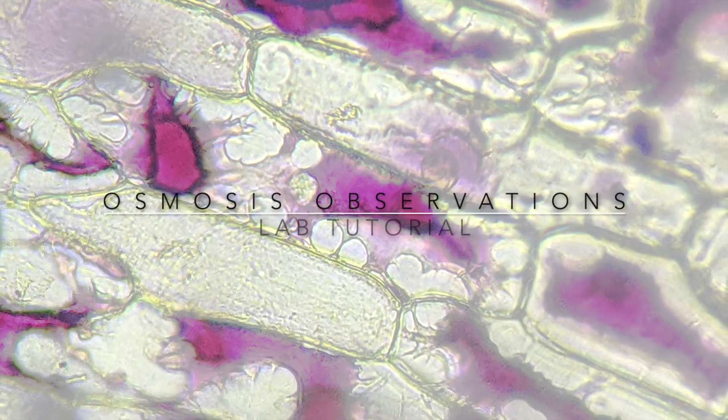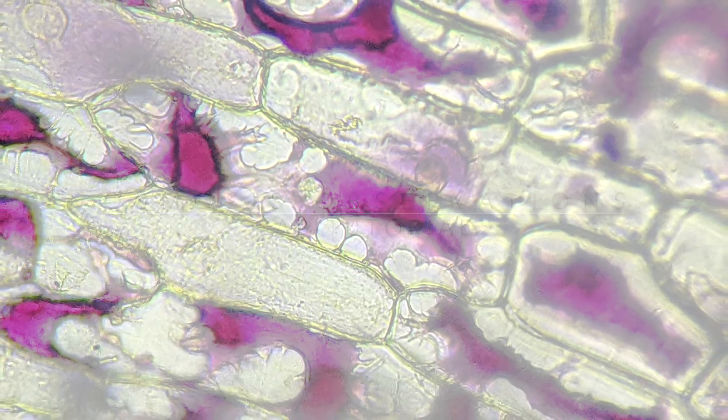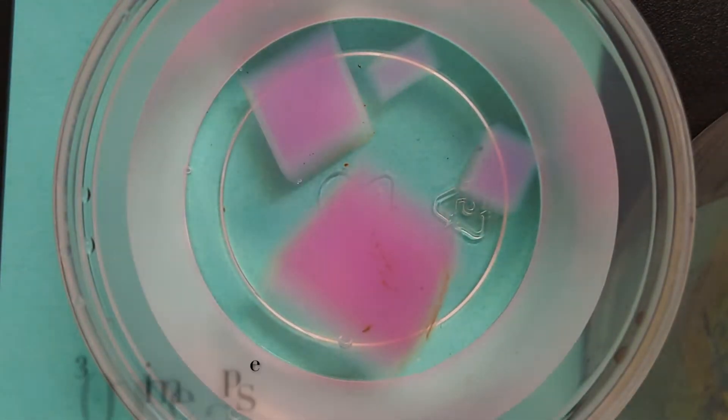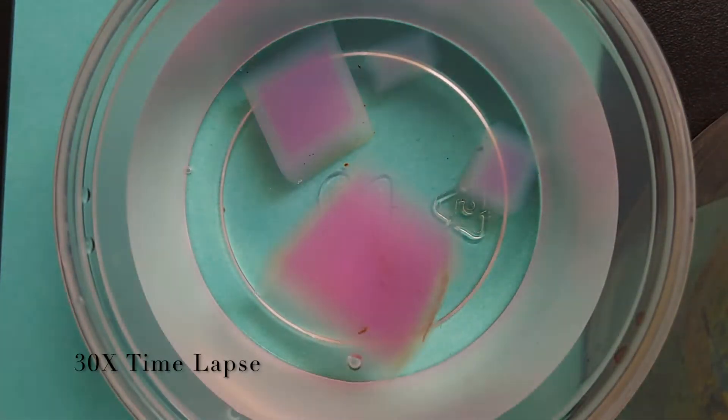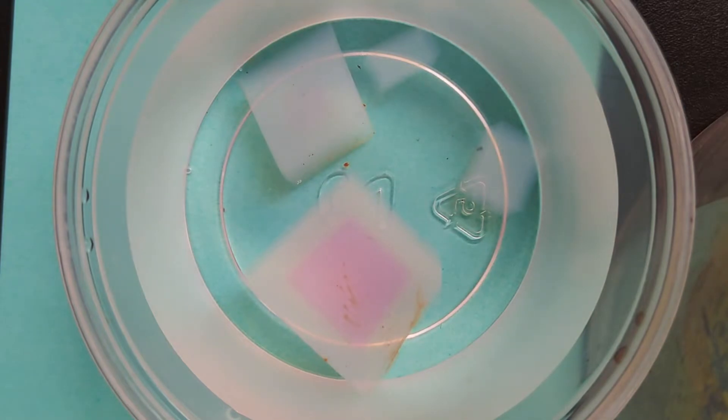This is a tutorial on how to observe osmosis in live cells. Often model cells are used to illustrate principles of diffusion and osmosis. Look carefully at these cells: the smallest one is already turning clear, the next smallest is clearing very quickly, the third smallest is starting to go clear, and the largest cell is still largely pink. You may be wondering what these model cells are and why they change color.